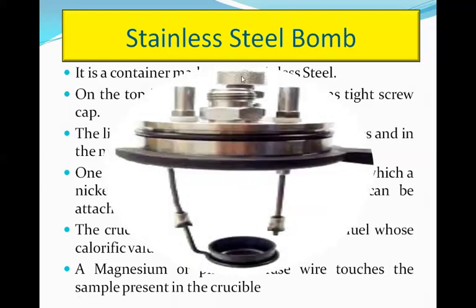It can be clearly seen that this is for the oxygen inlet, these two are for the electrodes, and they are electrically connected to the ignition unit.